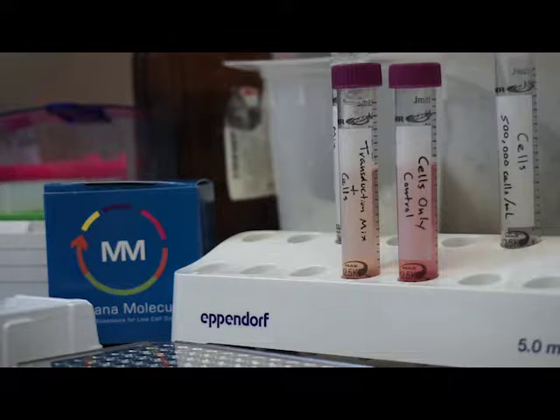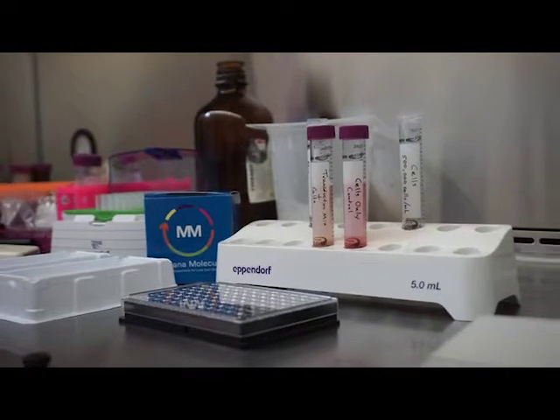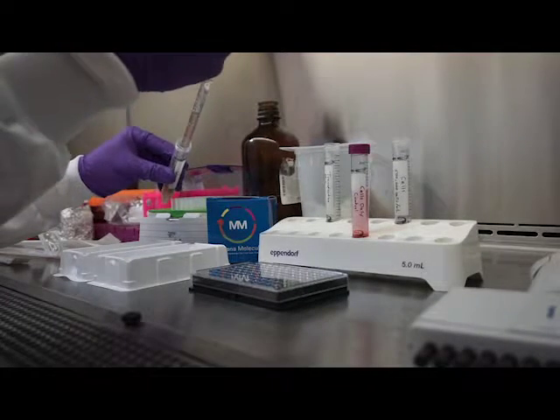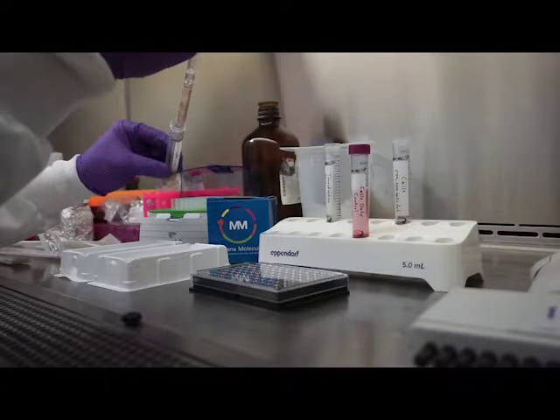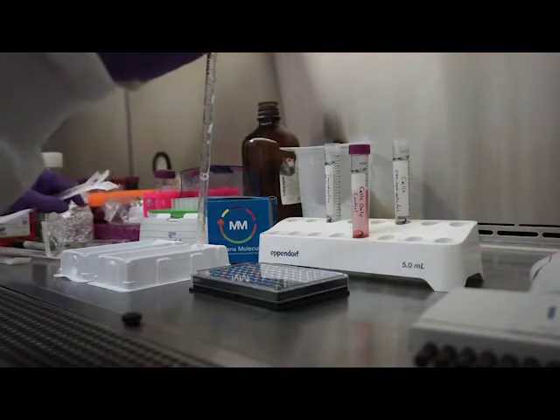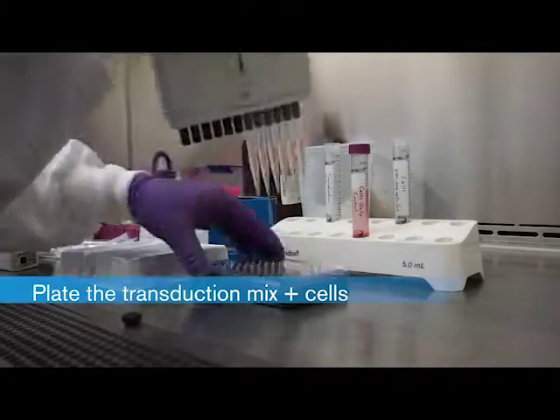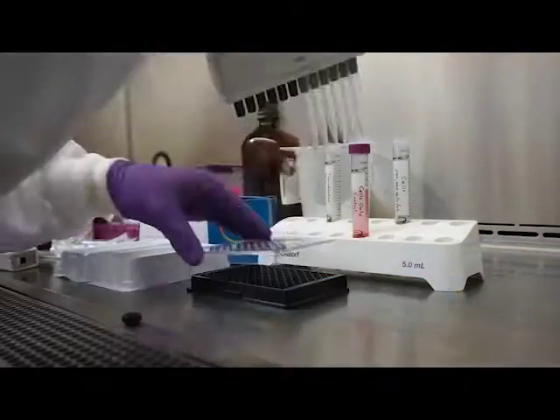In addition to the transduced cells, it is extremely important to prepare a set of wells that contain a cells-only control. These wells will contain cells only and no fluorescent sensor, and provide a critical comparison to the transduced cells. Specifically, they allow for calculating the signal to background, an important parameter in evaluating transduction efficiency and assay performance. For optimal assay performance, the transduced cells should give fluorescence values at least five-fold higher than the cells-only control.